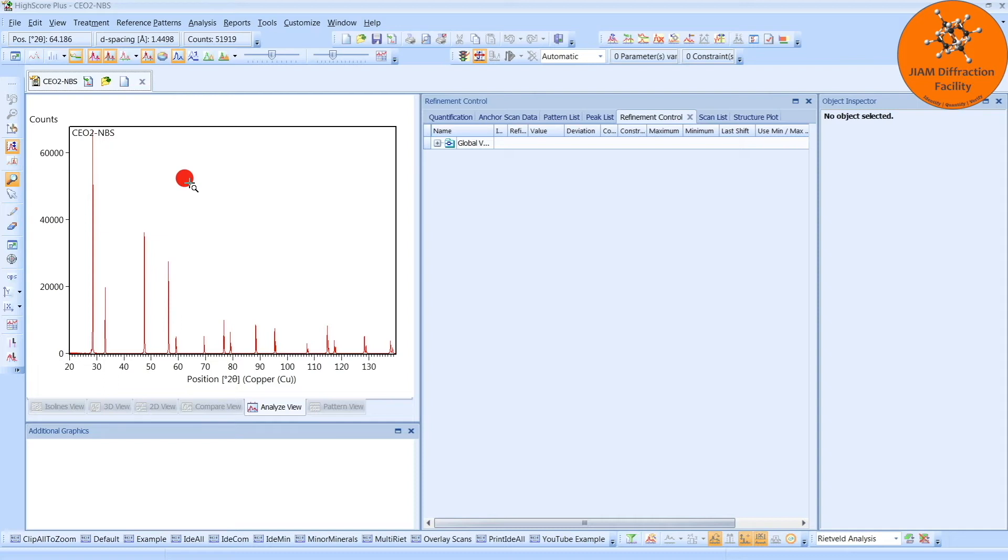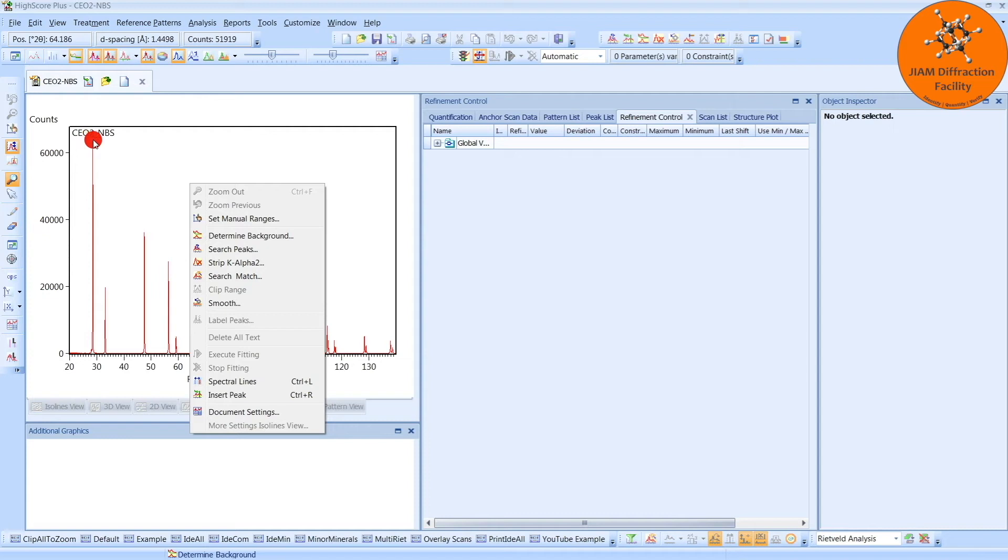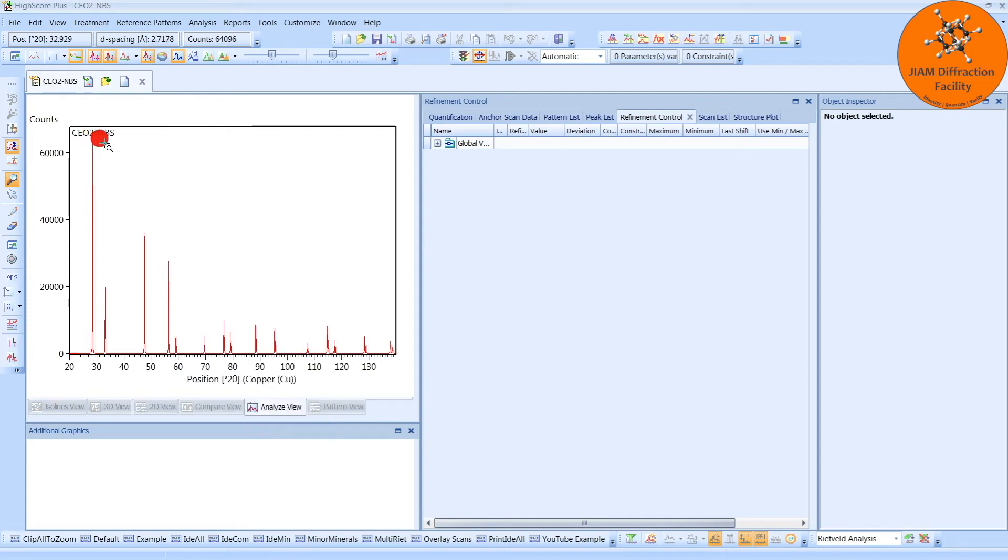With that warning out of the way, let's get to the part of this video that is different from my other video dealing with using Rietveld refinement for crystallite size and microstrain analysis. In the other video, I would right-click and perform a search match in order to get the candidate pattern for the standard phase, which was Silicon for that video, and then I converted it to a phase.